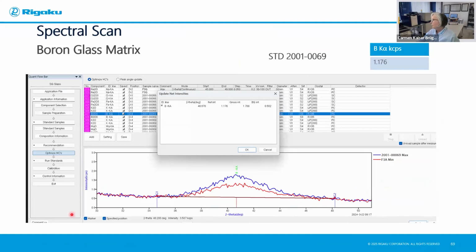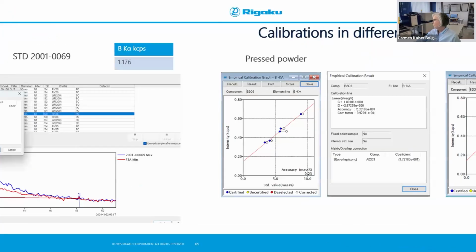Glass is also a slightly different matrix to the fusion because it's in a different form, with maybe high silicates, for example, and calcium that's present. Because of its different matrix, once again, we have a defined background for this kind of matrix.